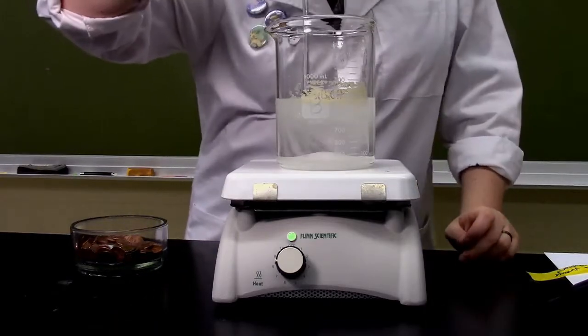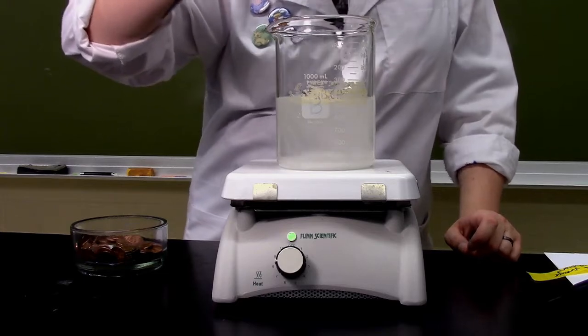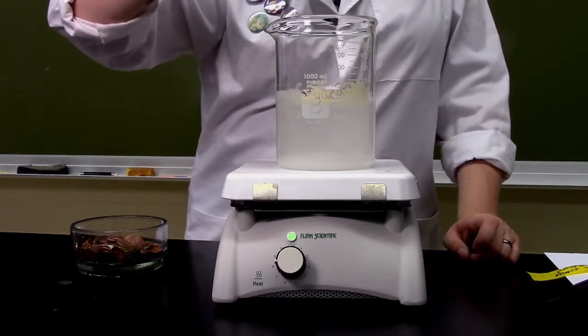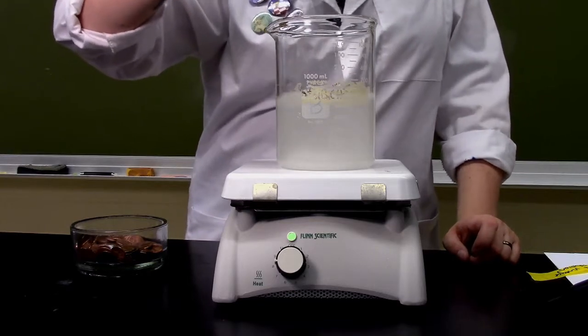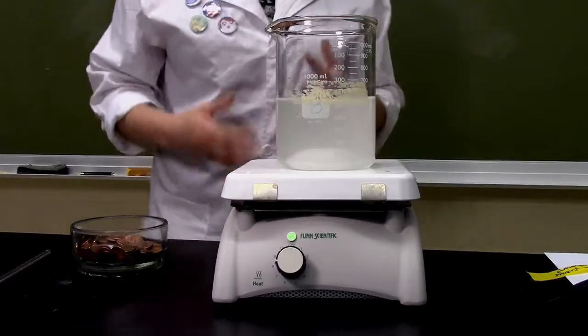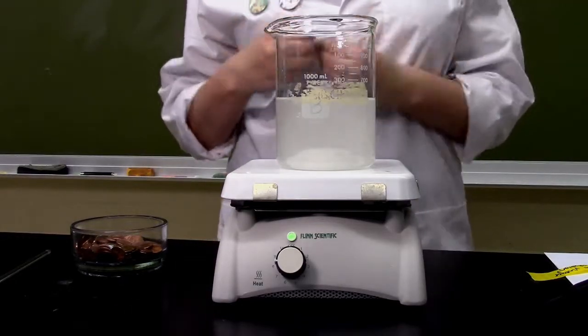Notice, this is actually pretty cool, our salt has actually settled at the bottom. It doesn't want to dissolve in the vinegar and the acid. So we add heat to help it dissolve, and it'll take a couple minutes. And I'm actually also going to add the pennies at this time and just let them sit in this mixture as it warms up.